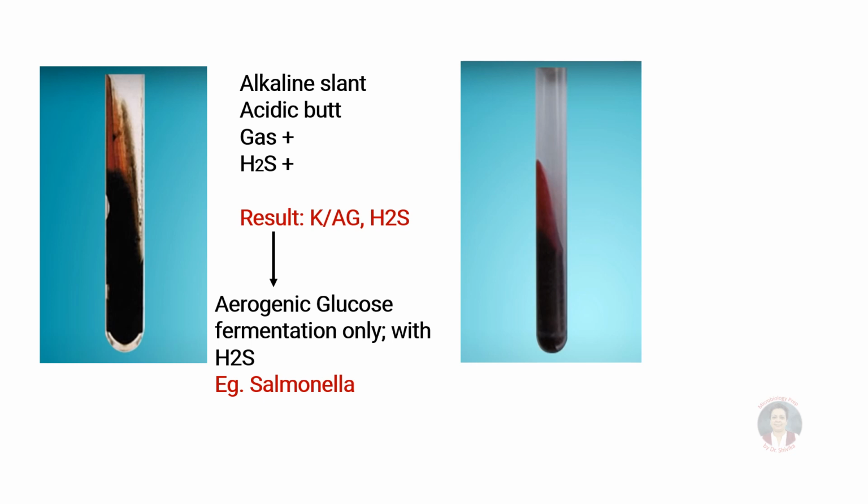Examples of bacteria which give this kind of result are most serotypes of Salmonella and some strains of Proteus which are aerogenic.